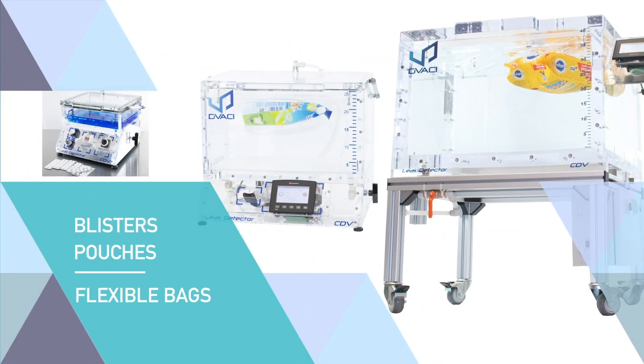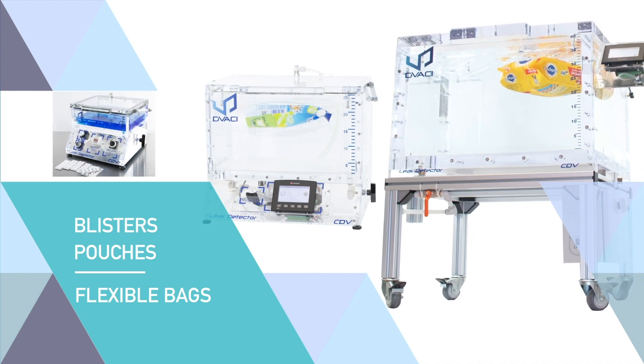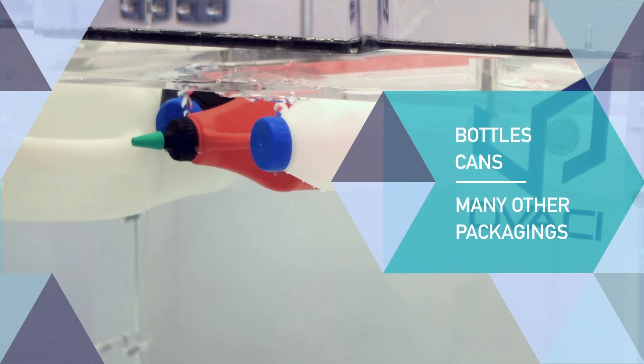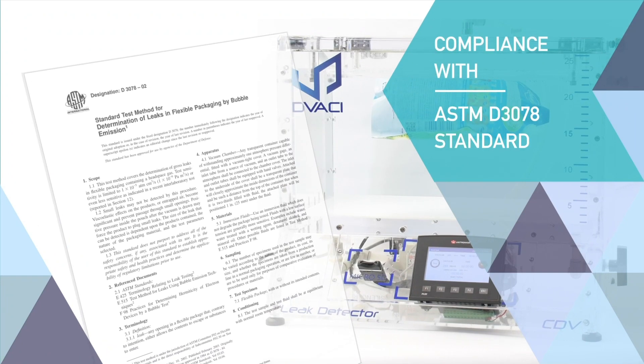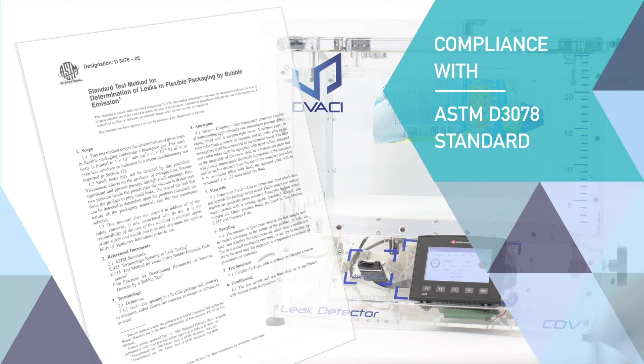CDV can be used to determine sealing properties of pouches, flexible packaging bags, blisters, bottles, cans, and many other packaging types. The testing process of the CDV complies with the ASTM D3078 standard.